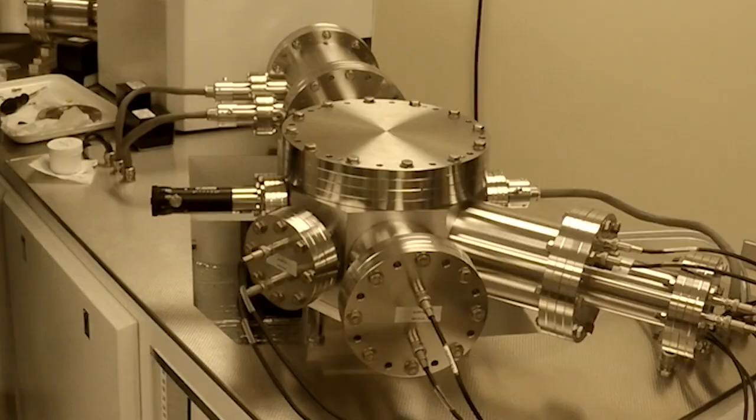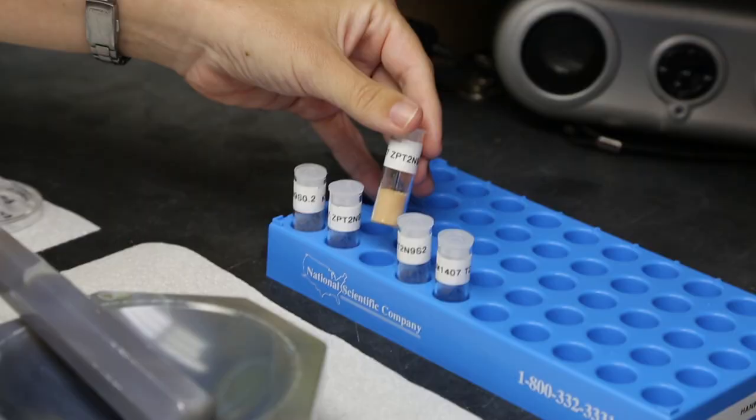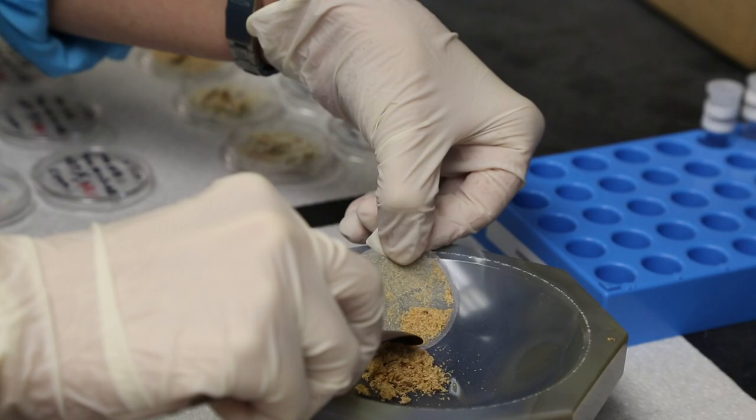The mass spectrophotometer is used to analyze the chemical components of samples. By comparing the different forms of elements, known as isotopes, researchers can determine where specific chemicals are coming from.